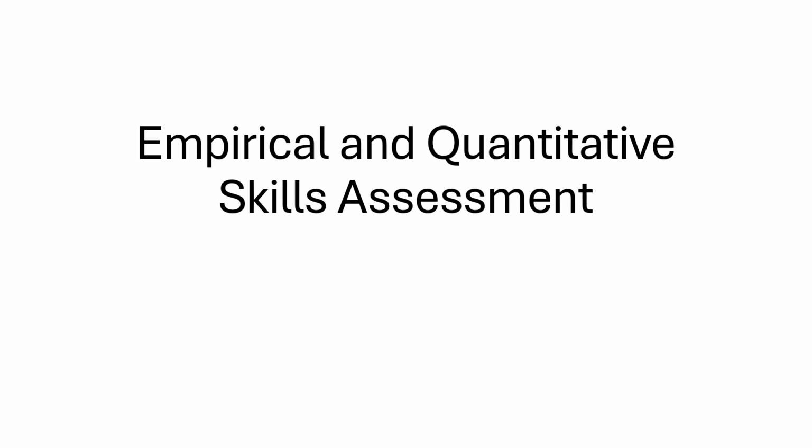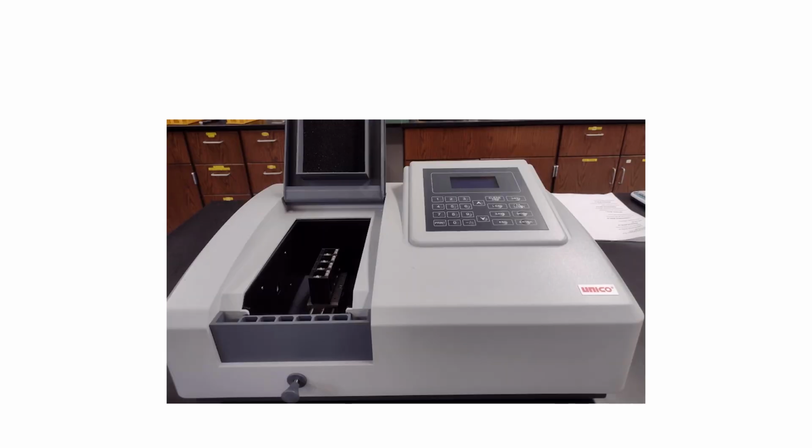Hi, this video is to help you with the empirical and quantitative skills assessment worksheet that we have. You do it as part of the lab portion. And so just to start with, I am going to show you some of the equipment that would be used in doing this type of an experiment.